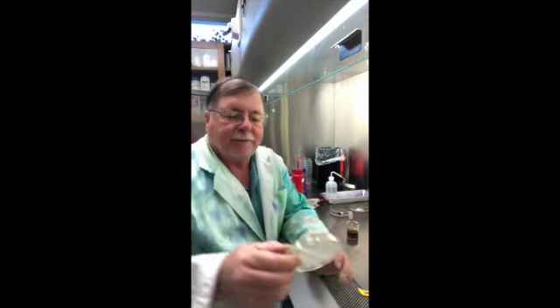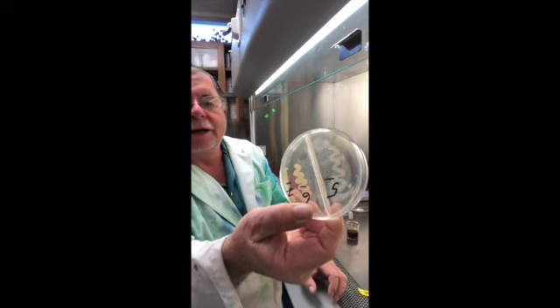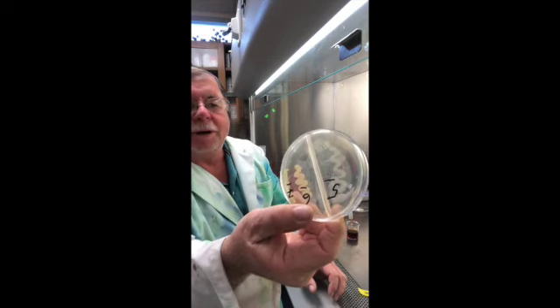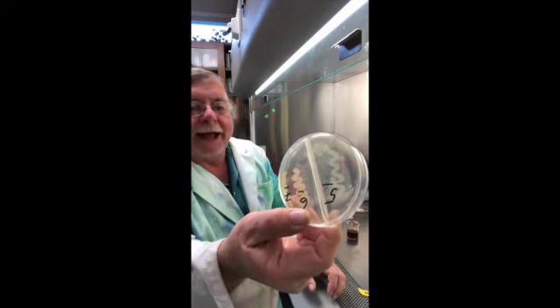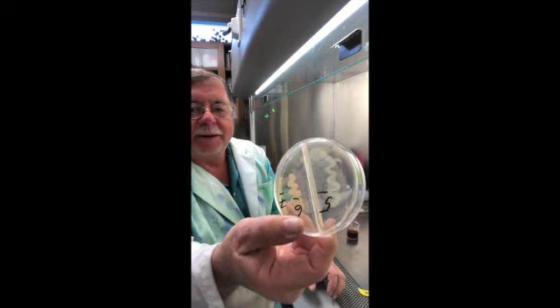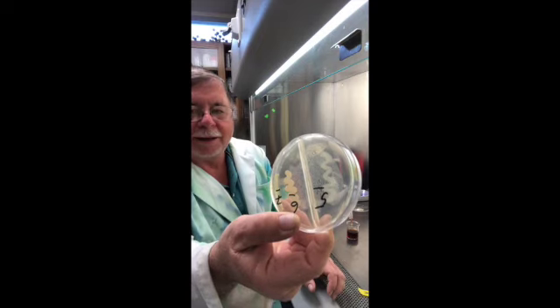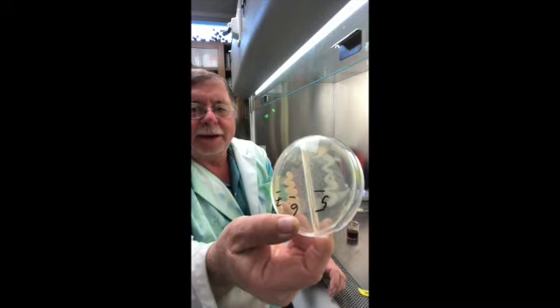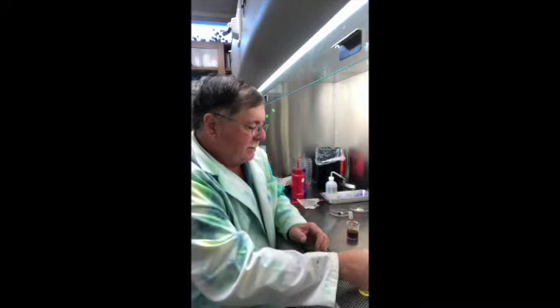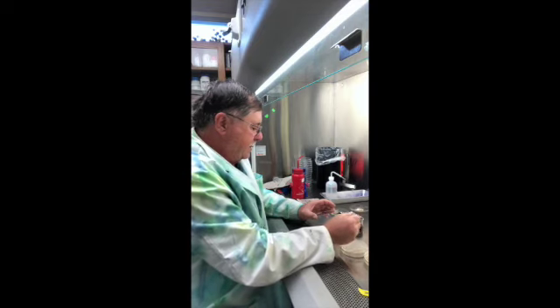Here's an example of number 5 and number 6 colonies. We just did a snake line of them. Everywhere there is starch, when I put iodine on this plate, it will turn black. If the enzyme has been released by the bacteria and broken down the starch into glucose, then it will no longer be black, and we'll see a clear kind of halo around that line of bacteria. So I'm going to flood the plates and then we'll look at the results. I'm just going to take a dropper full of iodine and drip it onto the plate and look for a halo.